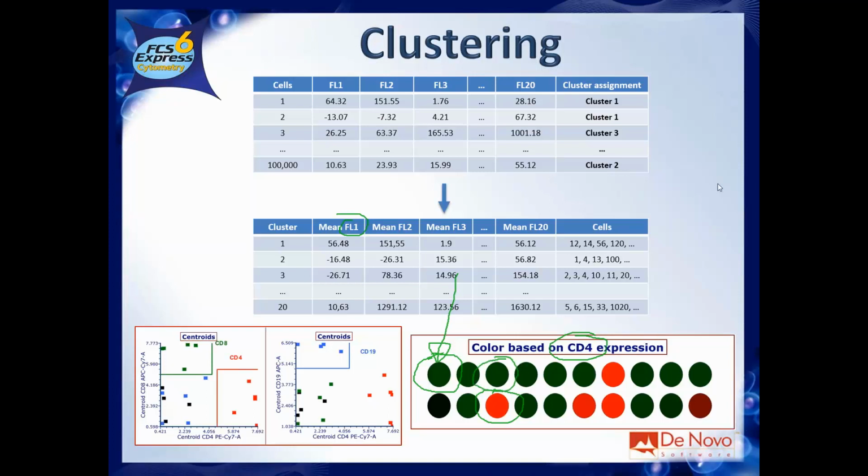So at least in this case, I can tell that I have 4 clusters very positive for CD4. I have a slightly positivity here. So those are probably those 4 clusters, the 4 very bright and the dimmest one. So this is the general idea of clustering, but the example of clustering that I want to present you is SPADE. So let me go on here.